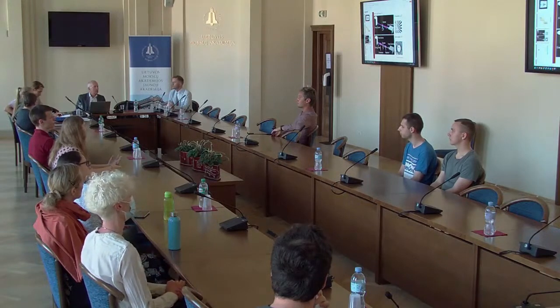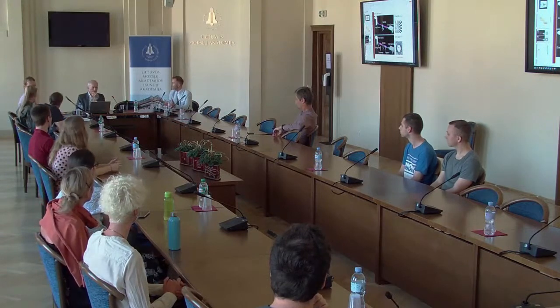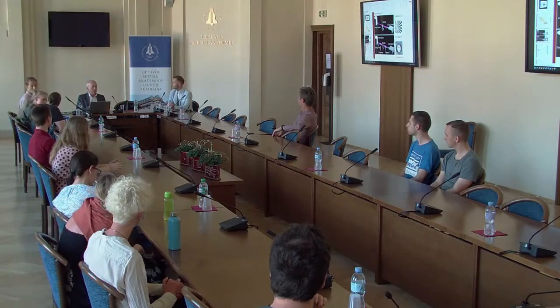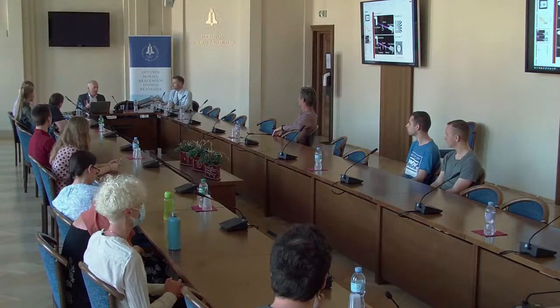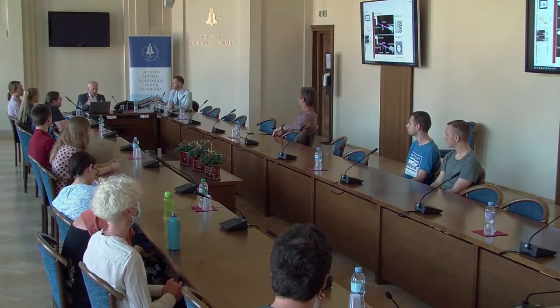Ar vieną. O kur dar juda šitas visas mokslas? Ko gero truputį mažės, iki 30 gal nanometrų galima važiuoti, bet taip pat daugiausia vystomi detektoriai ir šaltinis. Bandoma padidinti šaltinio galią, kad galima būtų matuoti keičiantis laikui. Jeigu mes matuojam 4 valandas ir per tą laiką kas nors keičiasi, tai yra blogai. Jeigu padidinsim šaltinio galią ir galėtume pamatuoti per 10 minučių, tai kas nors, kas per valandą ar per 2 įsivysto, mes galime jau su tokiu šaltiniu matuoti.